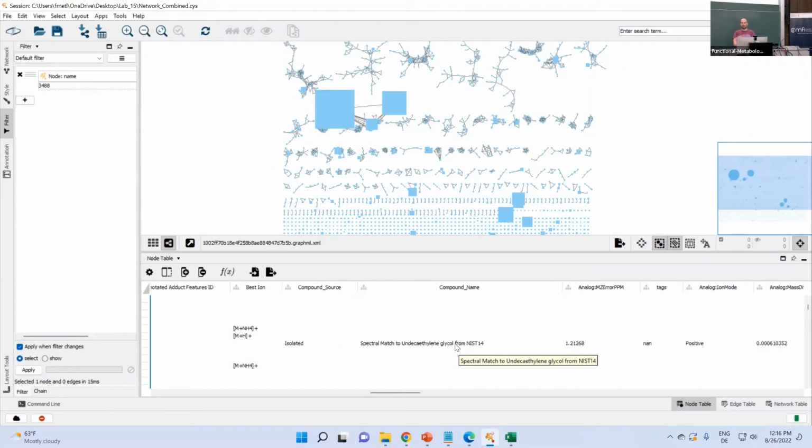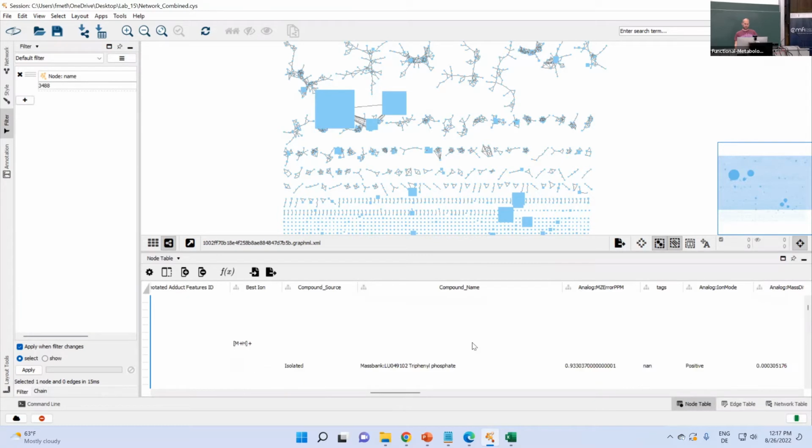So it's a lubricant that is often used for filter coating, I don't know, in syringes to make things go smooth. So it's really widely used and we see it a lot. So if I would see that, I would always be cautious. Doesn't mean that it's not in your sample, but that's a common contaminant, similar to plasticizers.